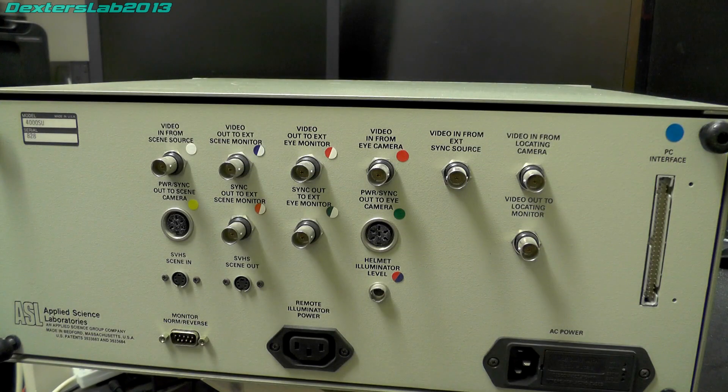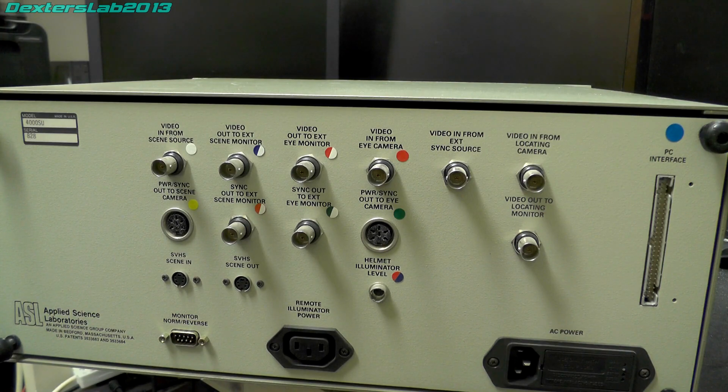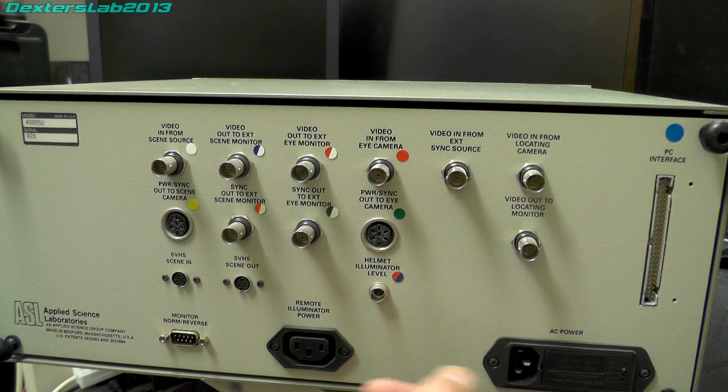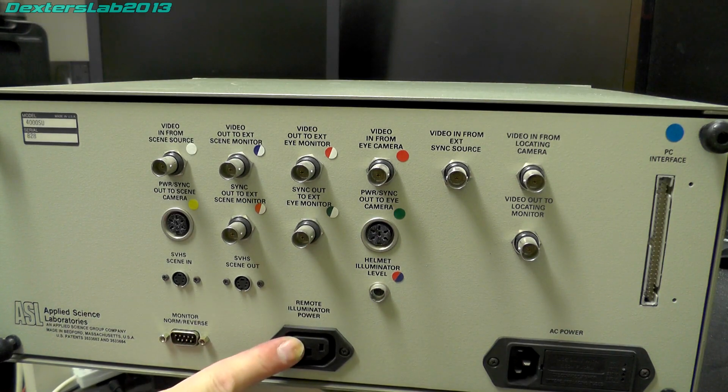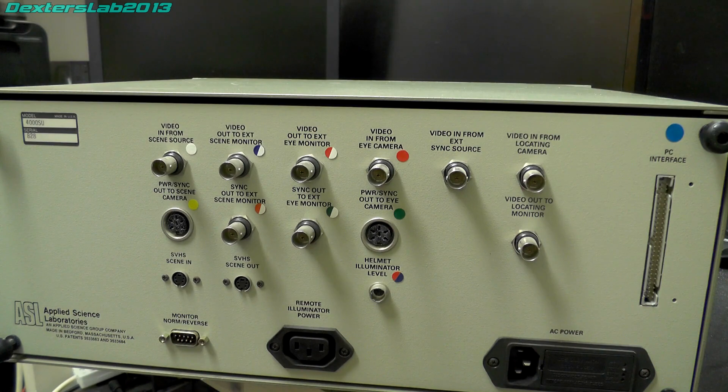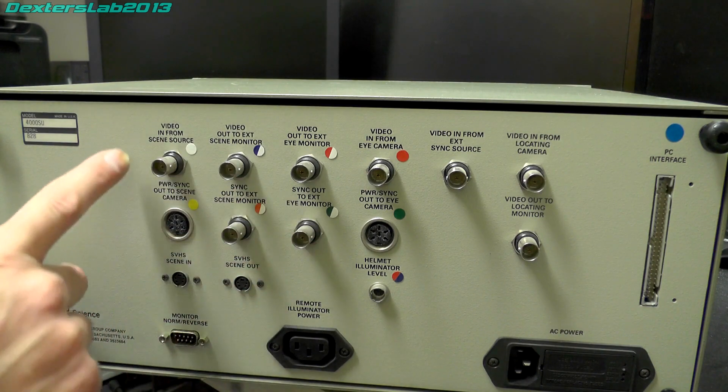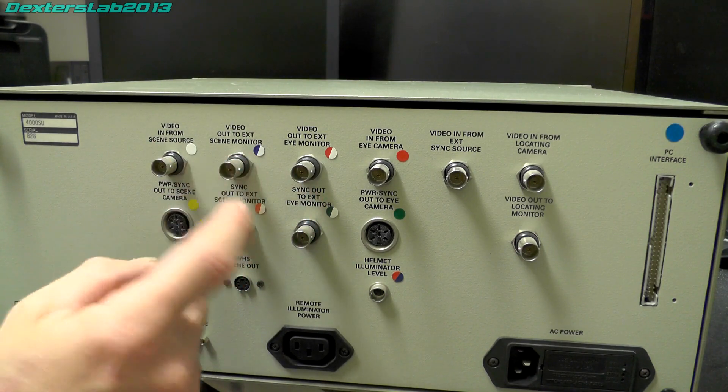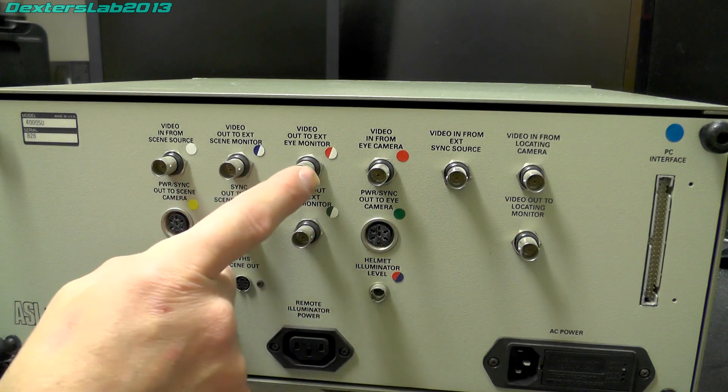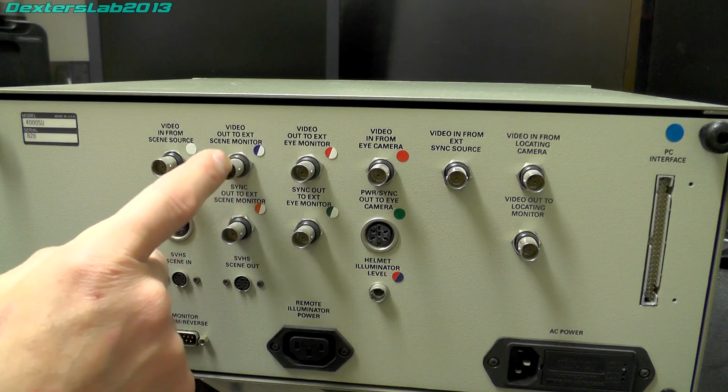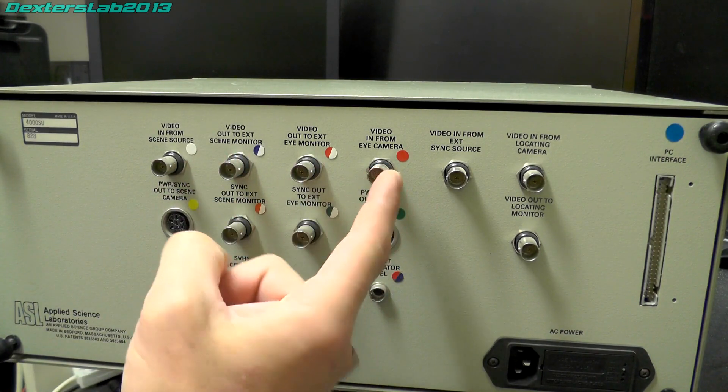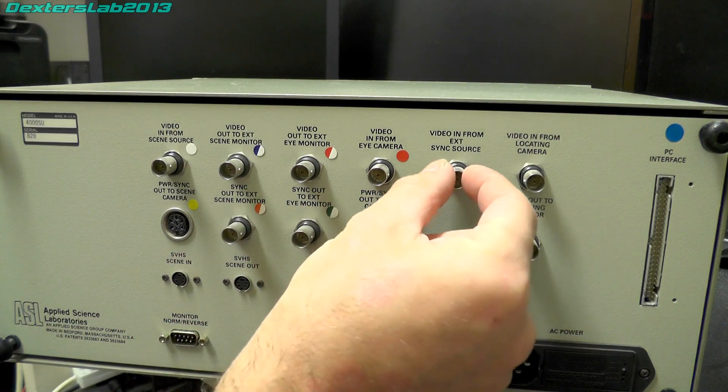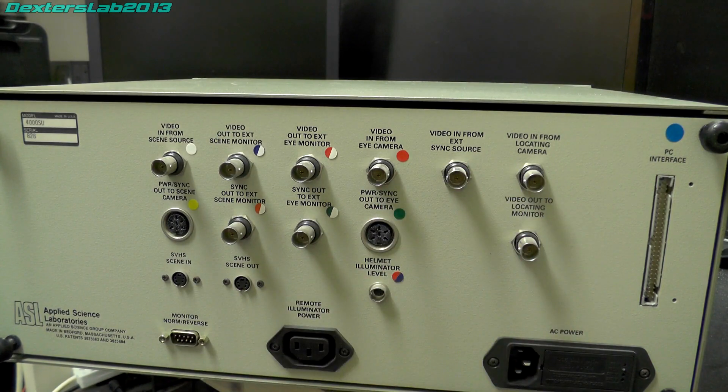As you can see there's quite a few connections on the back here, which is why I was hoping it would have been quite interesting. But you'll see on the inside that it's not quite what I expected. We have power input, standard IEC plug. We've got remote illuminator power, that's a power outlet. We've got various video connections: video in from scene source, video out to external scene monitor. These are all going to be in pairs. Video out to scene monitor, video out to eye monitor, video in from eye camera, video in from external sync. That would be logical, it would allow you to sync multiple cameras and various things together.